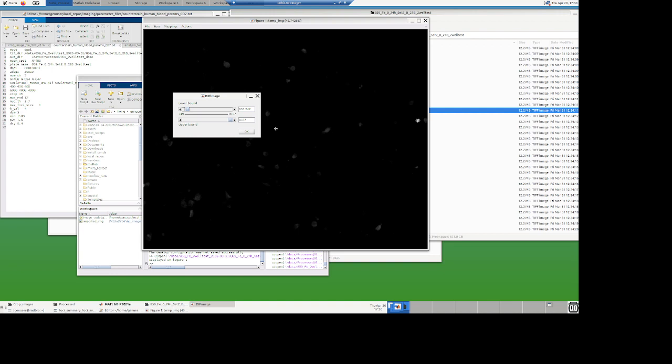The only way to do that is to project the image and save it as a JPEG with the exact same boundaries for min and max, so that if you're above 6,000, it will be white. If you're below 400, you will not be considered. You'll be cropped. That's what that means. So here, let me show you what it looks like once I use that display, because that's the way the JPEG is going to be saved.